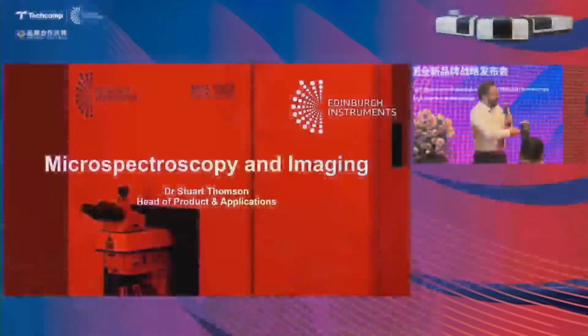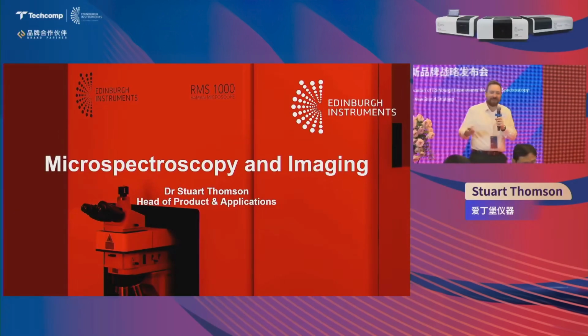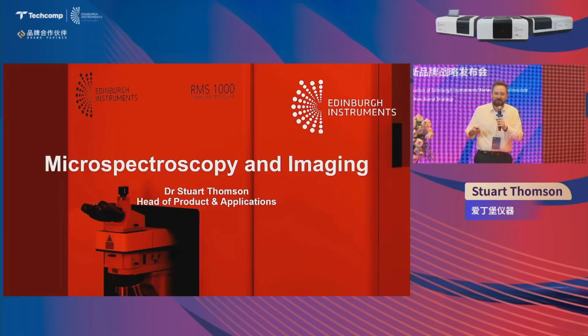So in my talk this morning, I'm going to present how Edinburgh Instruments can combine spectroscopy and microscopy for high-resolution hyperspectral imaging.